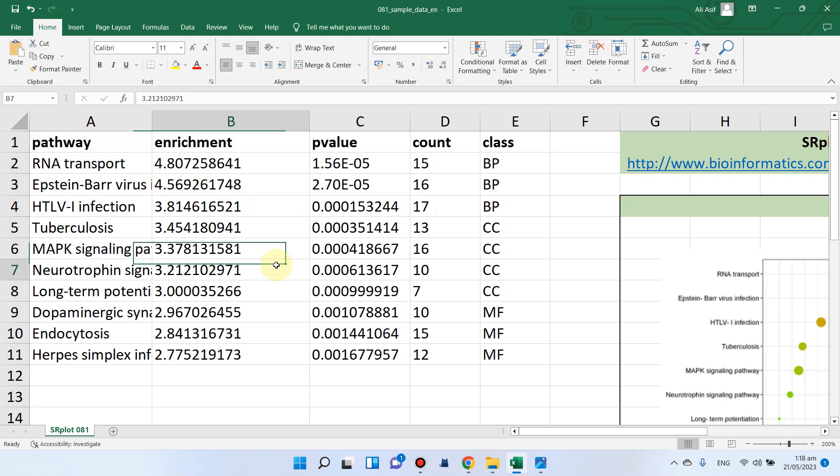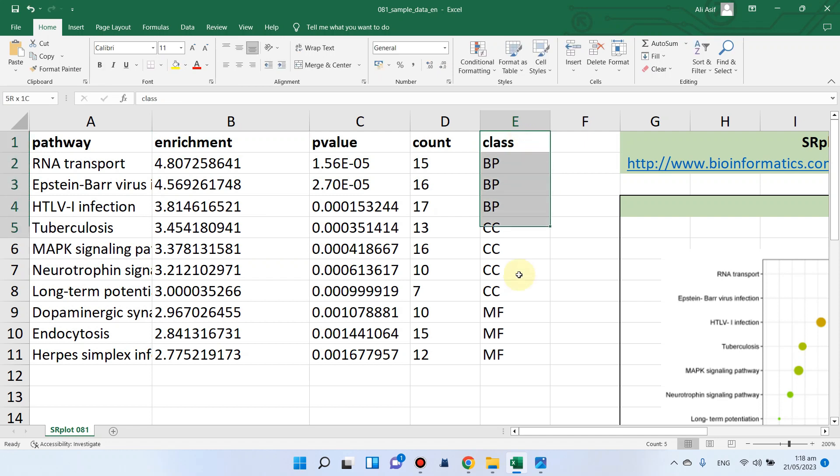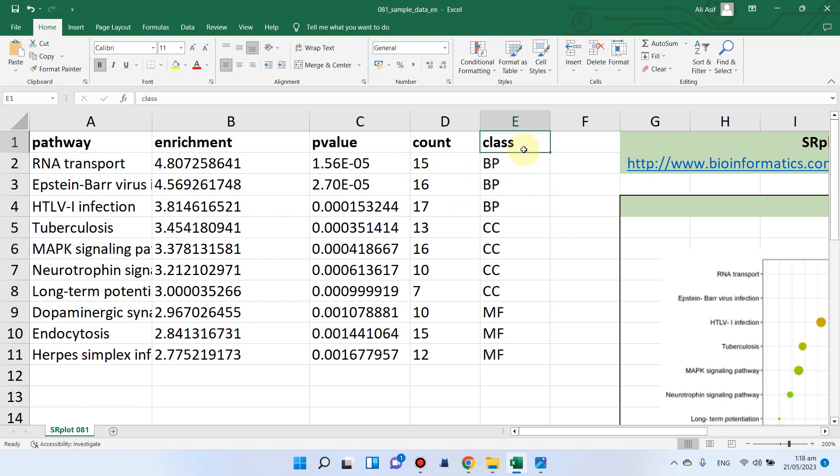The fifth column is only optional. If you want, you can paste it into that website. Otherwise, this fifth class group is optional. We can copy the first four columns which are required for KEGG pathway enrichment analysis.